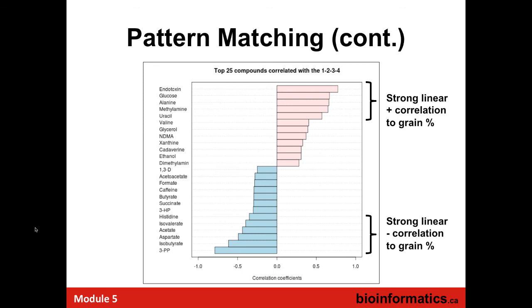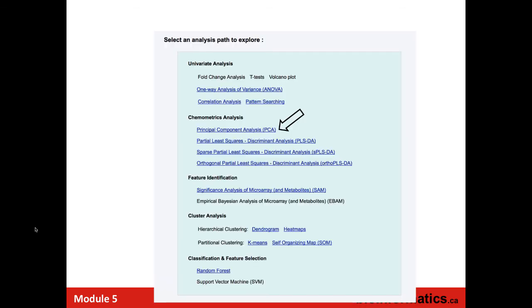And you can choose where you would say something significant. You might say, I want a correlation of greater than 0.5 or 0.6, and you can say which one is the pattern that best matches this. So that's ANOVA, and that's sort of pattern analysis within ANOVA.